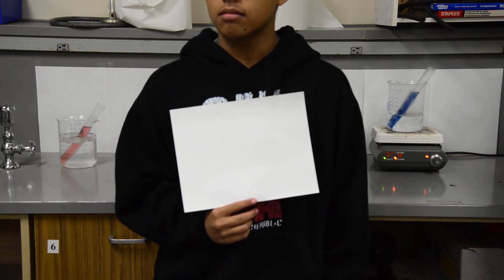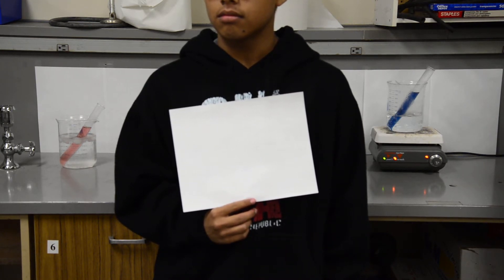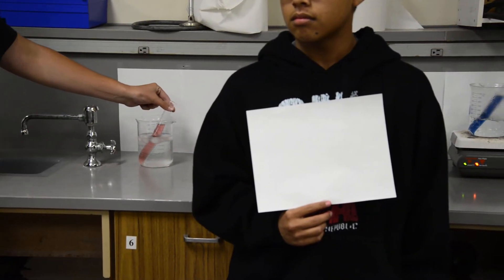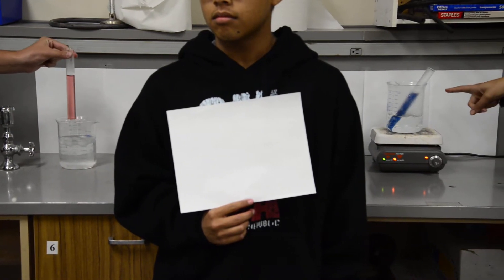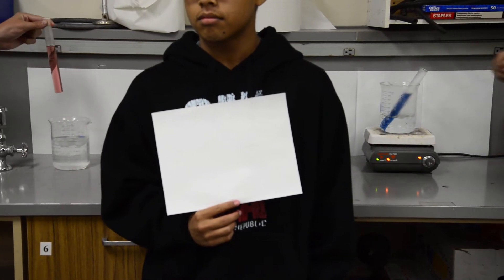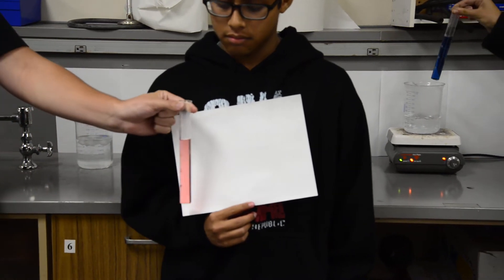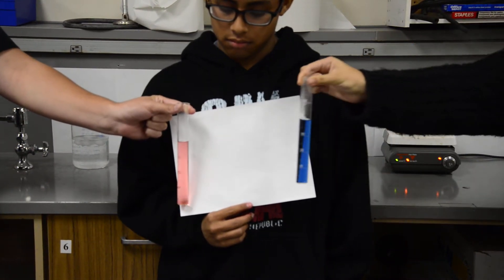We're going to pick up the tubes from the ice water bath on your left and from the hot water bath on the right and take a look at the colors right in front of the white paper. You can see they're pretty different.